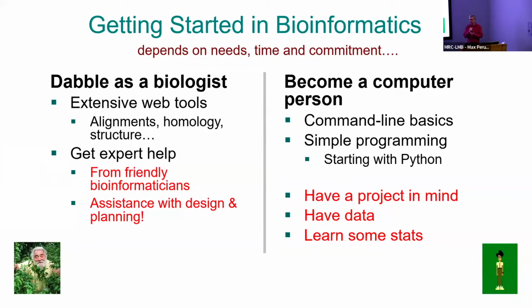So we like it when people come to us for experimental planning, particularly with sequencing. When you've got options like, do I use paired end, single end, longer reads, shorter reads, etc., we can advise on what's going to give you the best results, at least in the statistical sense, in the long run. We often get people come in at the last minute before they want to submit, and we think, well, why didn't you do another replicate or whatever it is?